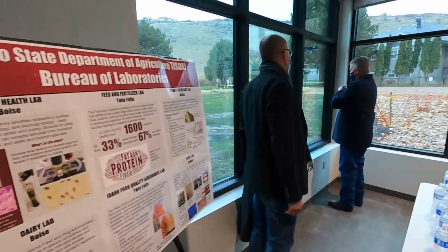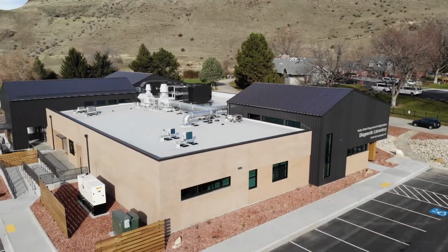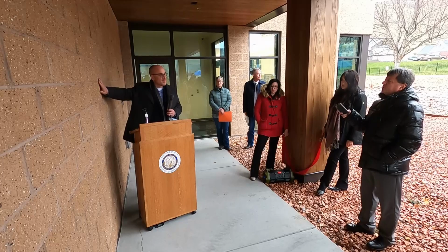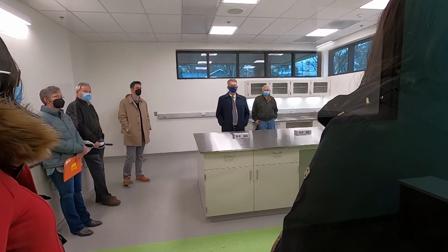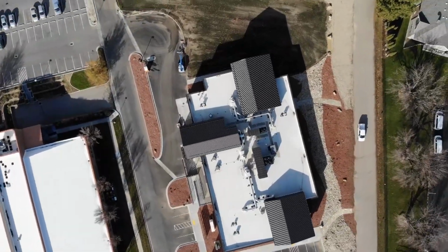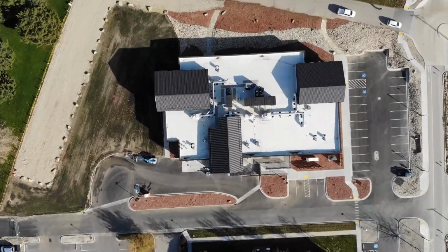so we probably have about 50% more square footage in our dairy lab, which is responsible for testing products around the state and training industry staff and their facilities to make sure that they're processing everything properly according to FDA guidelines. And then right behind this wall is our plant pathology lab, and they test for any kind of crop disease, viral, fungal, bacterial, whatever, to ensure that Idaho's crops are safe for import, safe for export, which we're seeing a very large demand. The facility also has about a half acre behind the building to add more office or lab space if needed in the future.